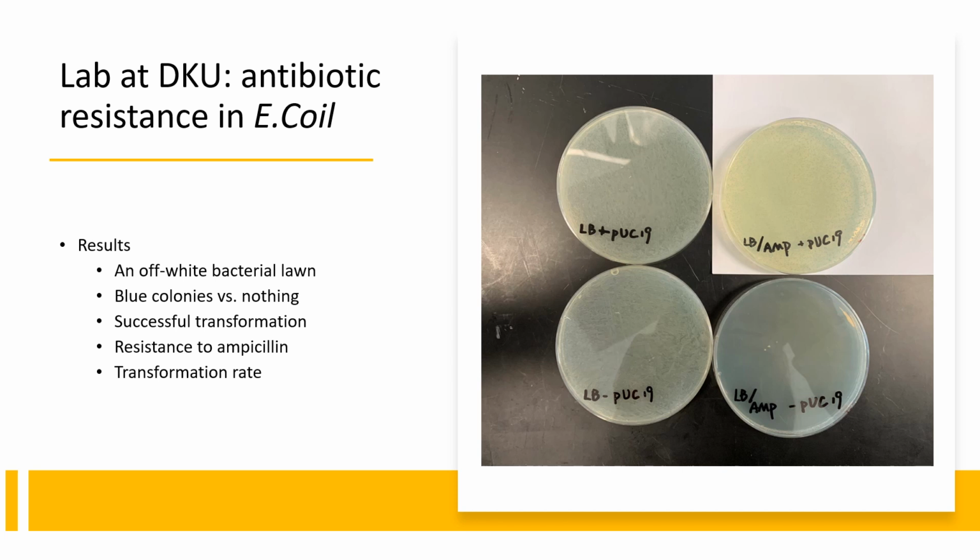Compared to the E. coli on the plate without ampicillin, we can see that a gap exists in the concentration of the bacteria, which is influenced by transformation rate. The transformation rate is controlled by multiple factors, including the plasmid size, the environmental pH and temperature. Many scientists are now exploring more factors to regulate the transformation rate of bacterial transformation.